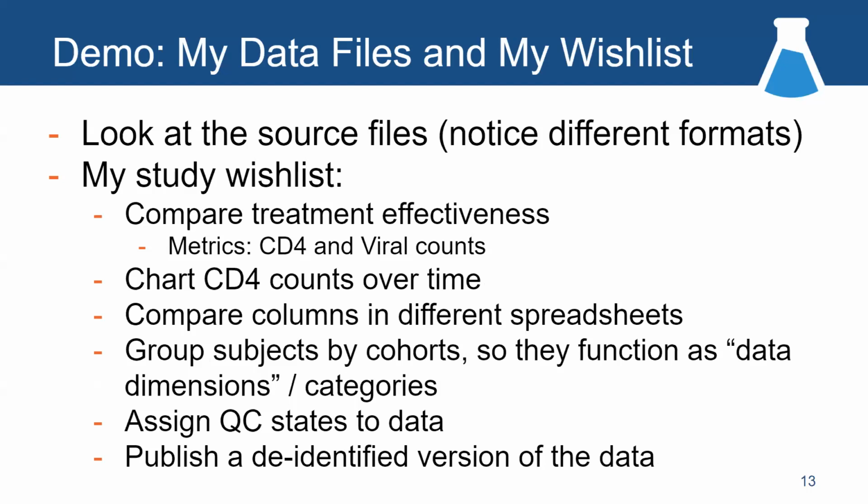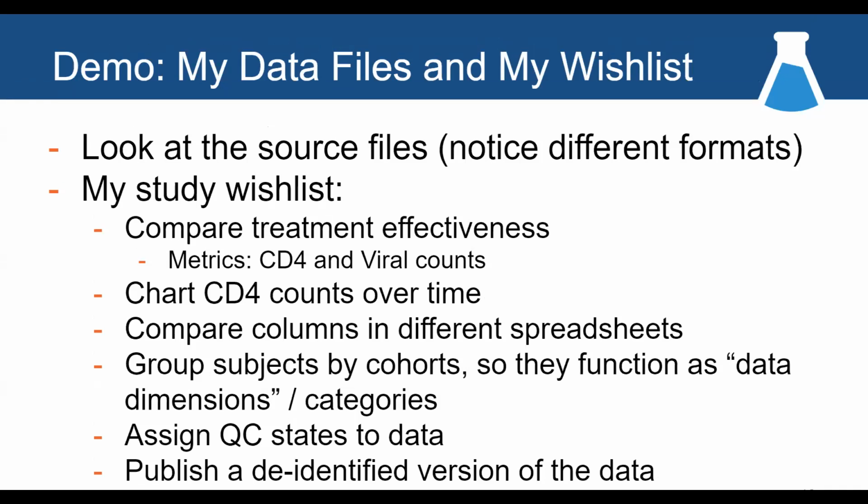First of all, I'm going to start out by looking at some fake data that I created. This is a set of Excel files, comma-separated files, and tab-separated files that I've collected on some subjects to study HIV. Again, this is data that I invented.